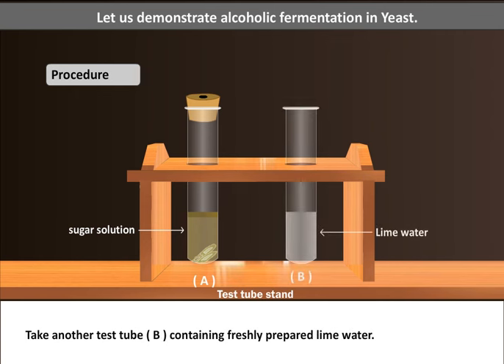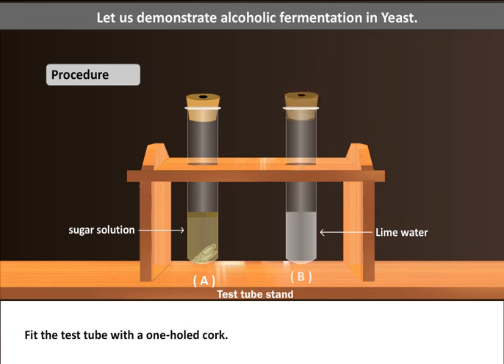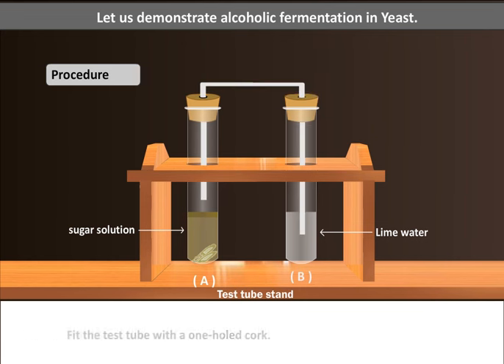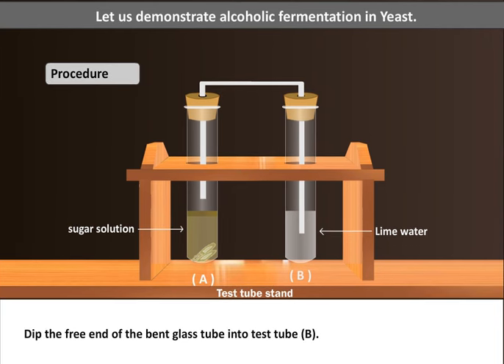Take another test tube containing freshly prepared lime water. Fit the test tube with a one-hole cork. Now fit test tube A's cork with a bent glass tube. Dip the free end of the bent glass tube into the second test tube.